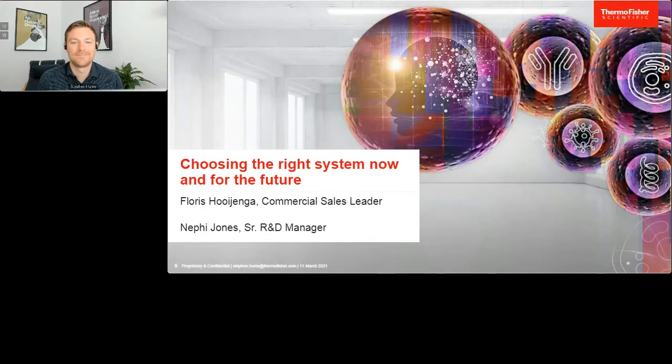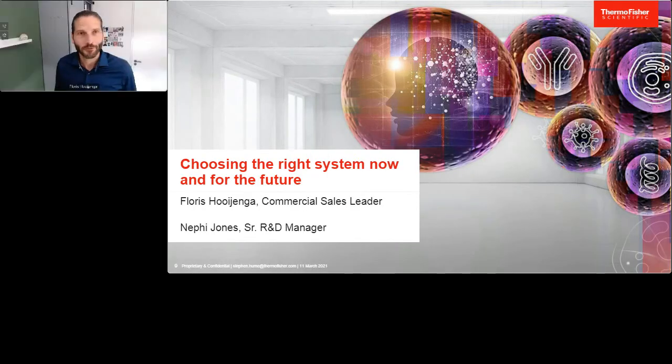Thanks, Steve, for the nice introduction. Good afternoon, all, and good morning if you're dialed in from a different location like Nephi. I'm very pleased that today we have Nephi Jones attending us for an interview to get more insight about scaling up from benchtop to commercialization. Nephi was also one of the founding members of the team that designed the first commercially available single-use stirred tank bioreactor in 2005. So that's really interesting to hear his perspective on that also, as he was involved with the long journey we had on the bioreactor.